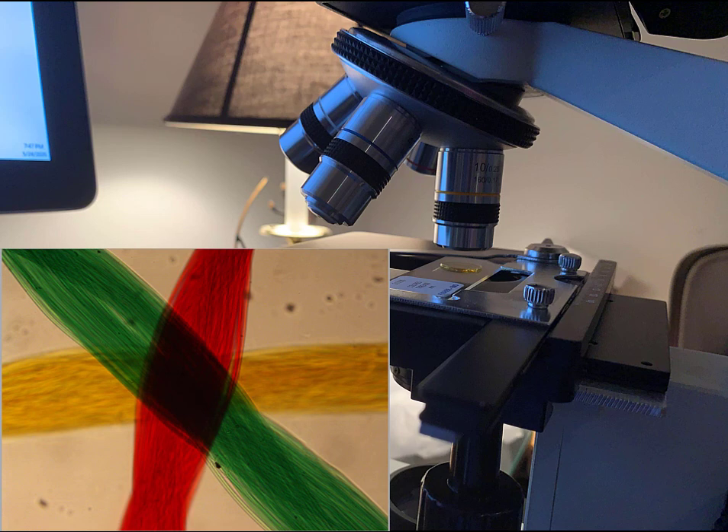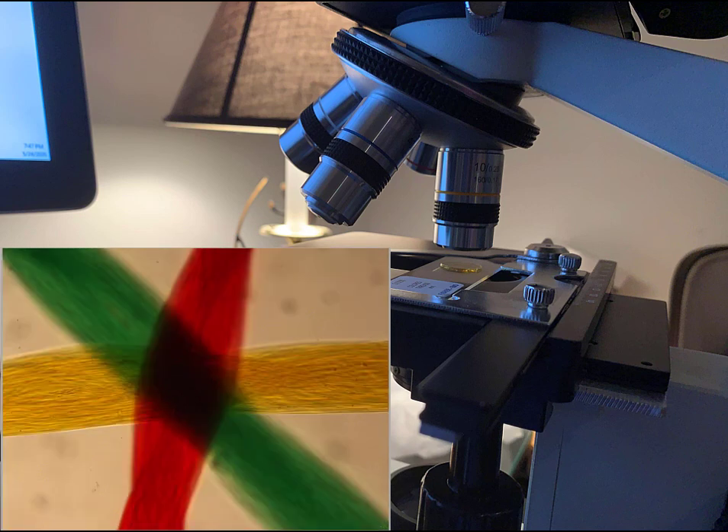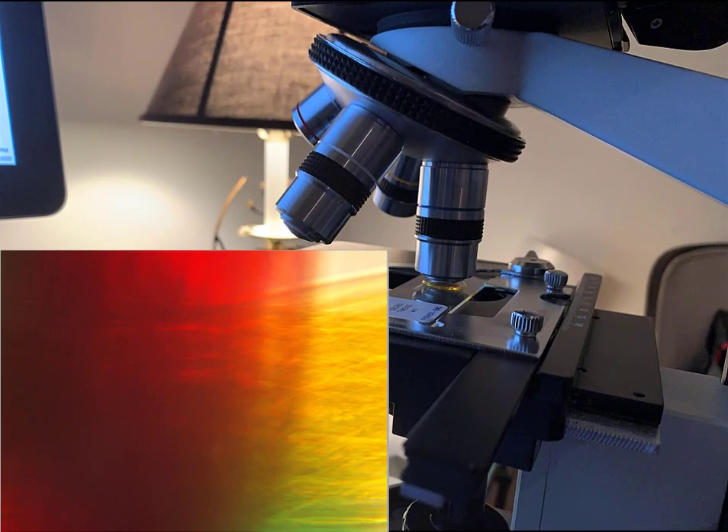Next, with the fine focus knob, we will bring the stage a little bit closer to the objective, which will have the effect of bringing the red thread into focus — because it, as we will see, is between the green and the yellow thread. Finally, with one more adjustment of the fine focus knob and bringing the stage a little bit closer still, we can bring the yellow thread, which is on the bottom, into focus. At this point, if we wish to view the subject under the high-powered objective, we can use the rotating nosepiece to twist the high-powered objective into place so that we can now view the subject at 400 times magnification. As you can see, for a subject of this size, this really doesn't give us very much information, except that we can now see the individual strands within a single thread.